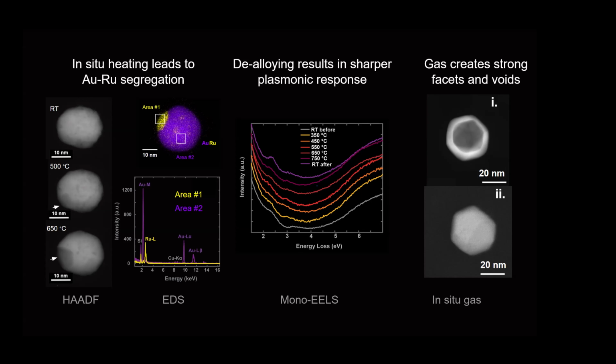It's quite something to have heat, light, and gas all going at once. And preliminary results are that we actually may see that the segregation is favored to optical hotspots. So if there's any pre-faceting of the particle, we start seeing subtle phase segregation along where those plasmonic hotspots may be. But there's definitely much more work to do. And this was exciting with like a 450 nanometer light. So it was in the interband regime for gold. So excited to see what happens when we can do more of a wavelength sweep.